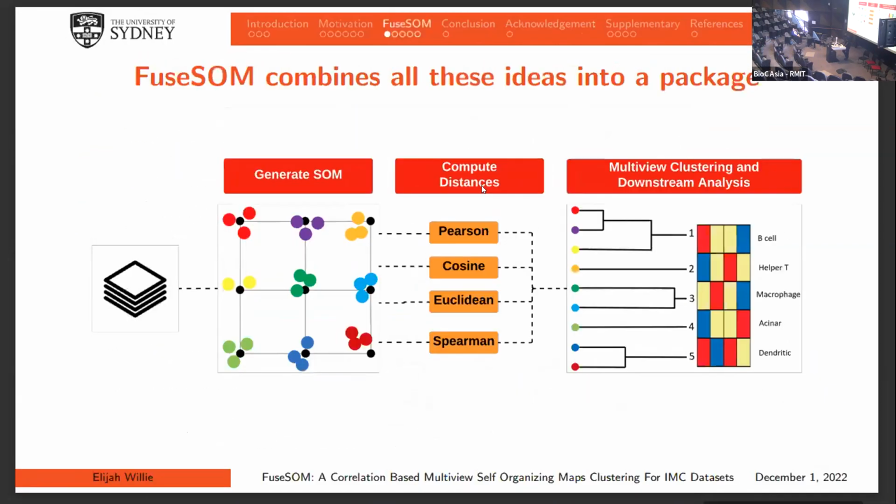The correlation is n squared in the number of points. So if we have an 800,000 by 800,000 matrix, you would get a huge matrix. It's too high of a computational burden to do, so I just computed it on the meta cells, or the prototypes.